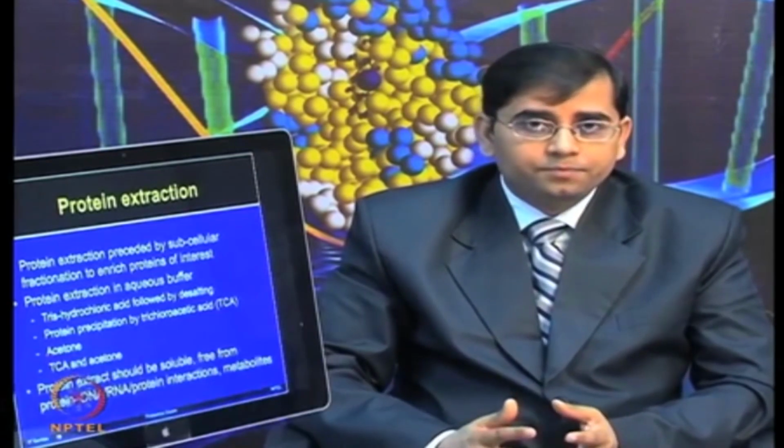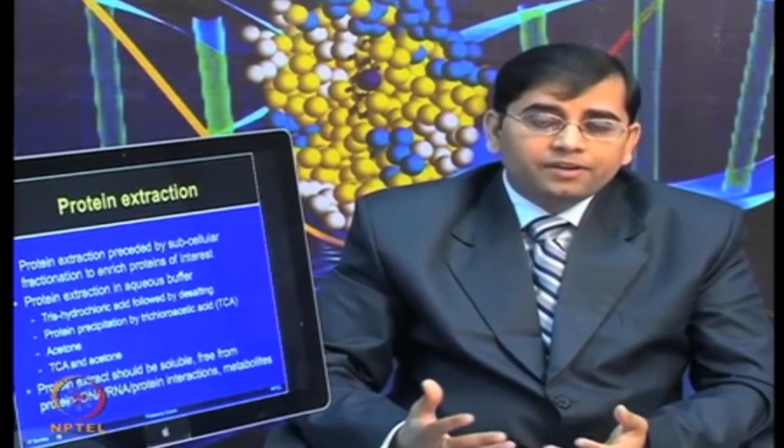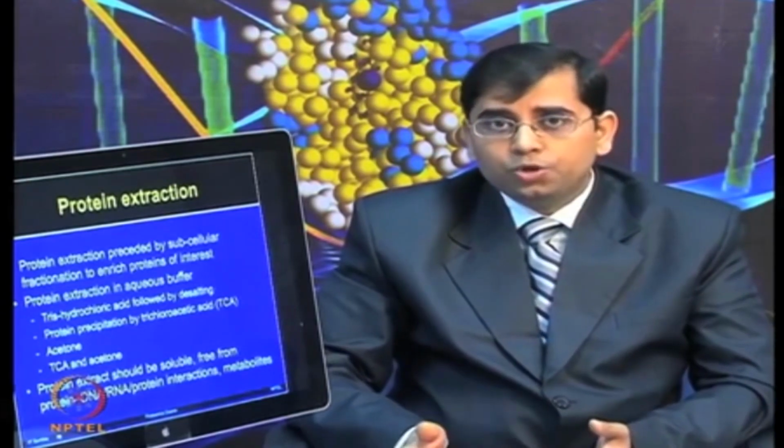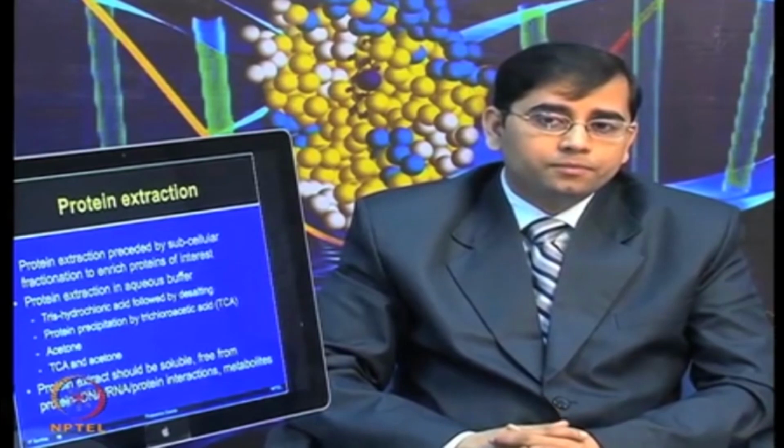So, protein extracts should be soluble, and free from protein-to-protein interactions, protein-to-DNA or protein-to-RNA interactions. Similarly, there are other cellular components present, and those should be effectively removed.